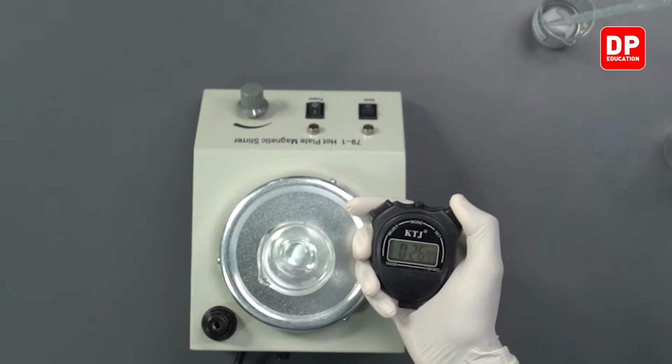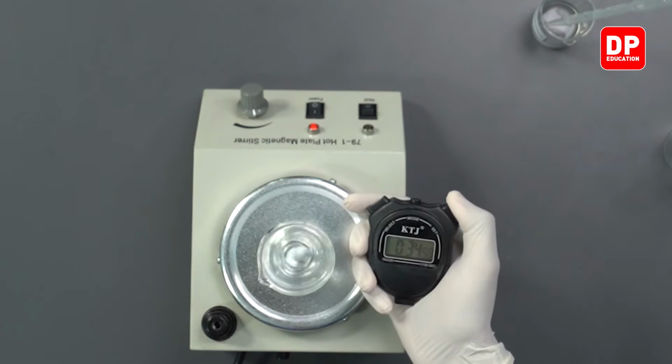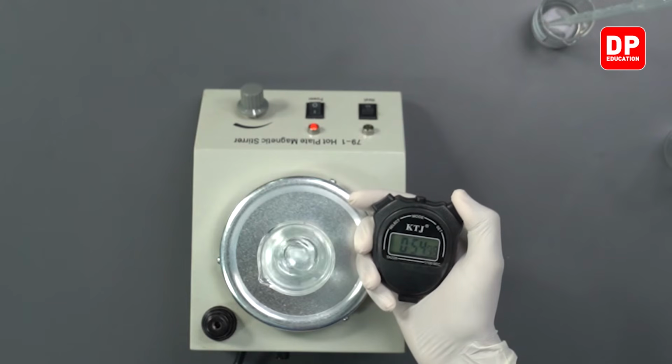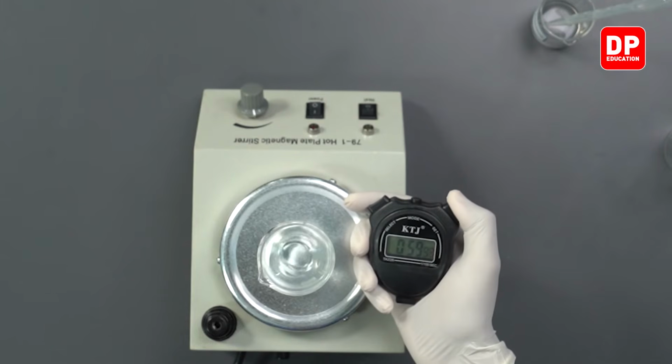We will have to wait till the color change is given. It's at 30 seconds now. One minute.